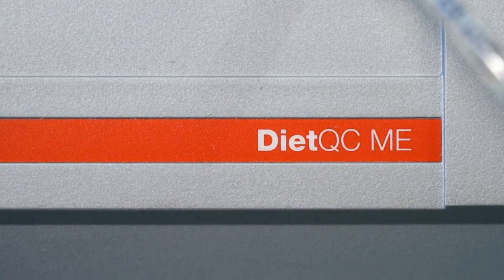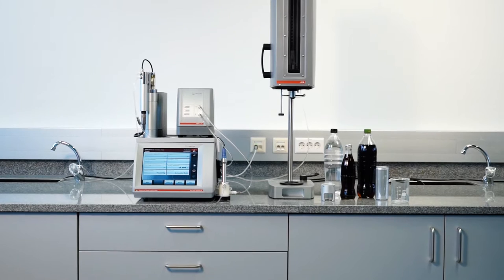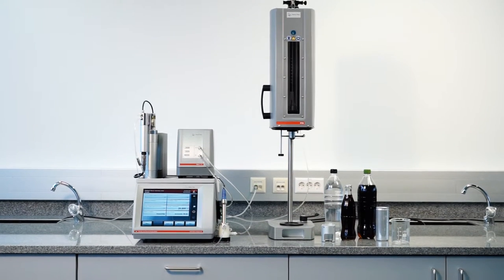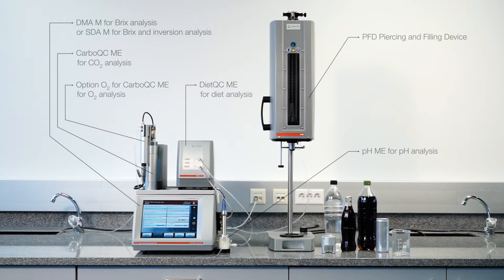The main measuring parameters are obtained simultaneously without prior sample preparation. While PBAS is commonly in use for the analysis of sugared soft drinks and sparkling water, PBASI is able to provide additional information about the sugar inversion process of the sample.